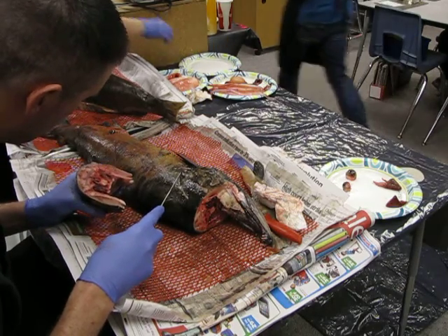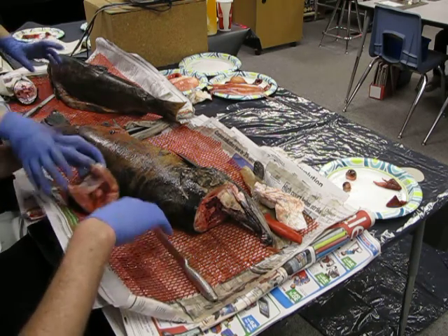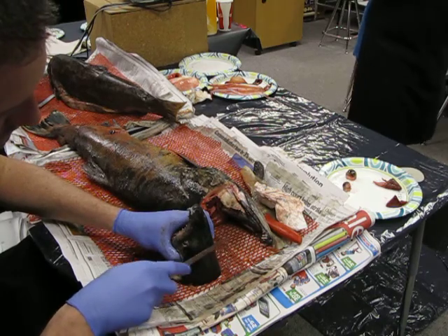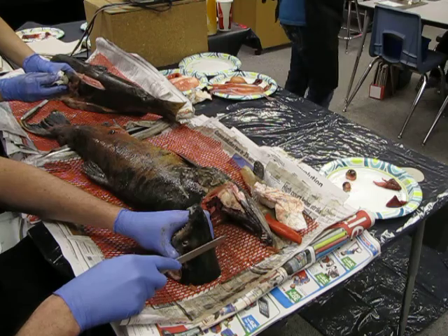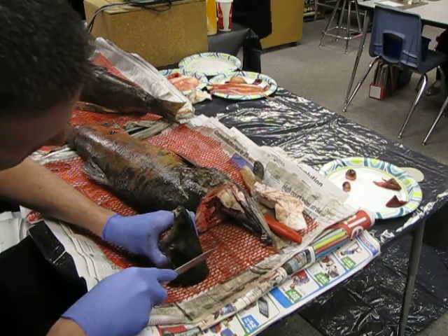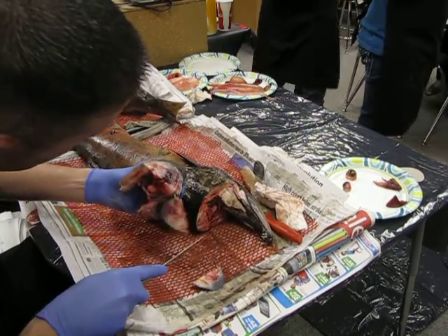Now, another thing that protects the gills. What's that? The gill cover. Now this is kind of like the cheek of the fish, if you think of it that way. These seem fragile, but they're actually made of bone. They're really hard. You can knock them. So when you feel these, I want you to feel how strong they actually are and can protect the gills. Yep, when they breathe, the gills open to let it in. Exactly. You got it.